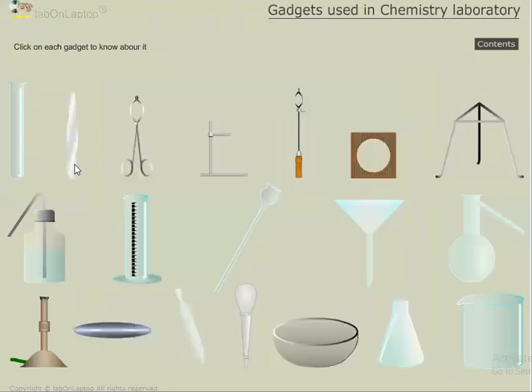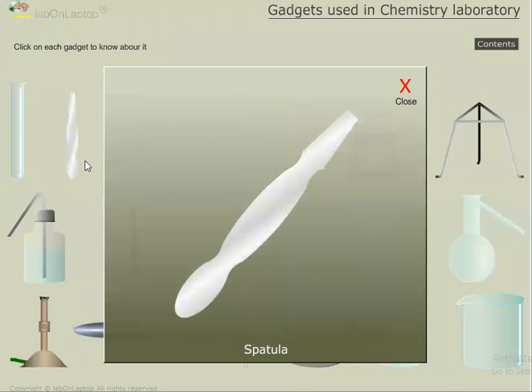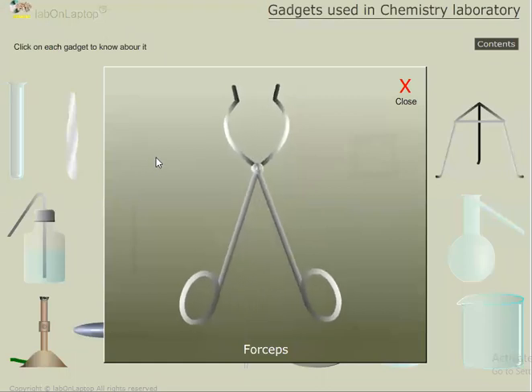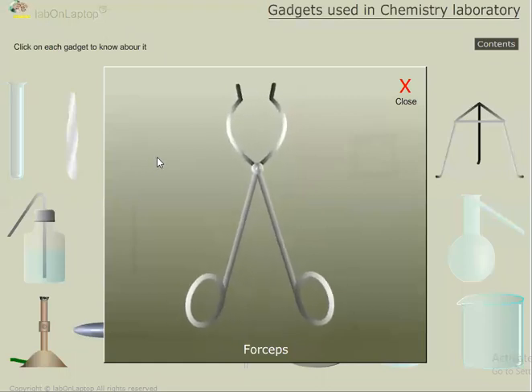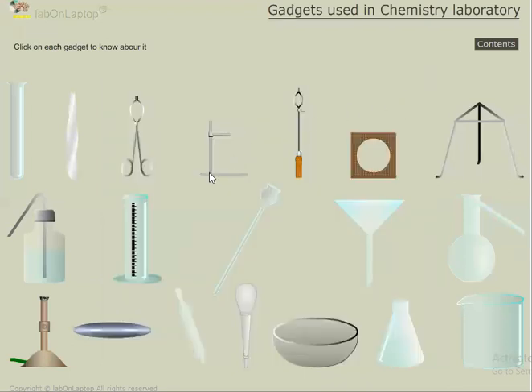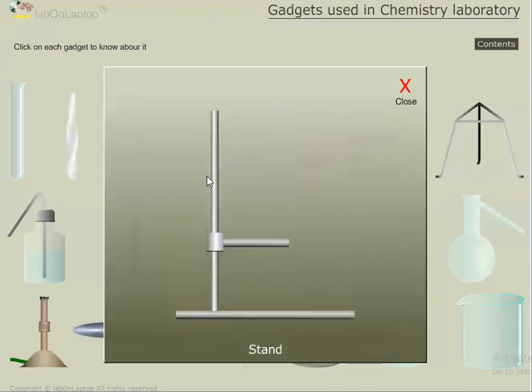And next, if you look here, this is a spatula. Like we can say that it is a spoon type. Okay, spatula, we call it a spoon in general language. And this is forceps. Simply we call it a scissor or holder type. The forceps we call here in chemistry language. And this is a stand, an adjustable stand to hold the test tube as well, or any wire, etc.